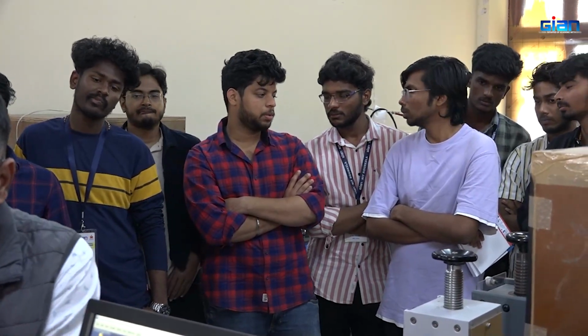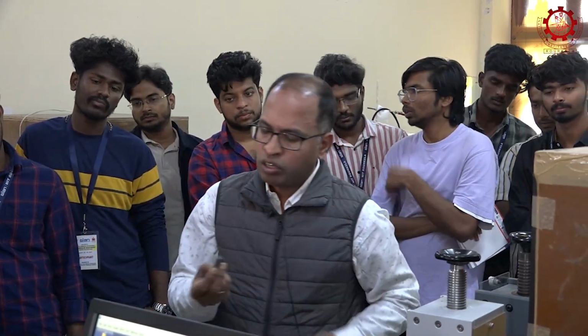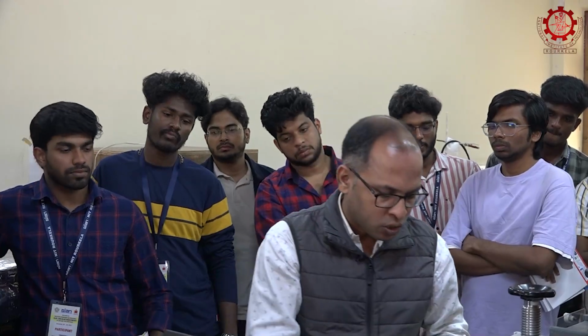Okay. So now in this we put that thin film, because of course mostly it will have this size, right, after pressing. So now that one will be pressed here, and we remove whatever we used to put the sample on top. Now we put it vertically, and IR radiation will pass from there to here, and then similarly it will absorb and you will get the spectrum here.